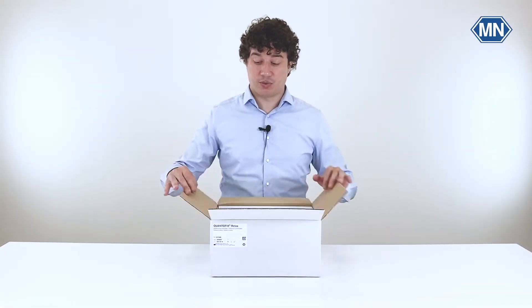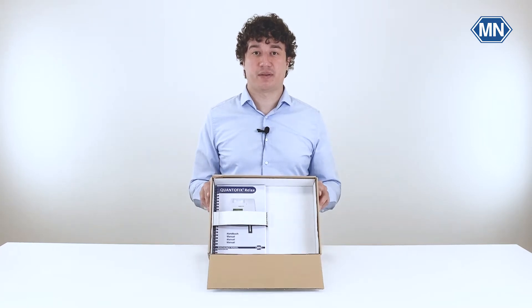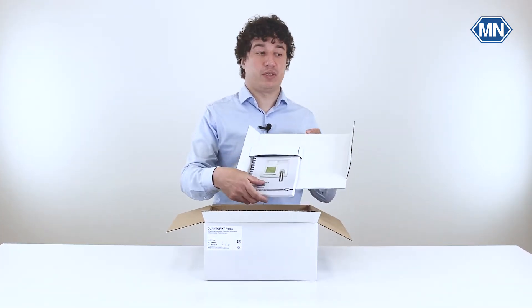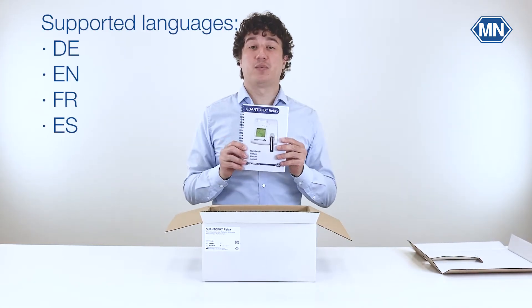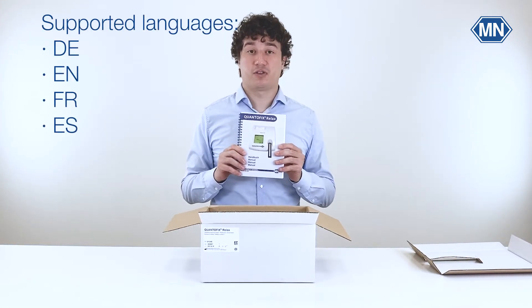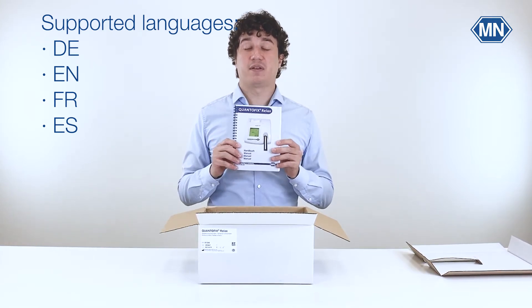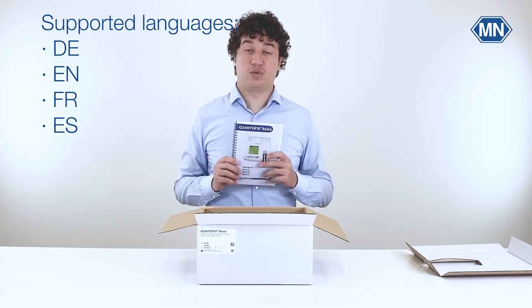Once you open this package you will notice that the device is protected by another layer of cardboard. Take out this piece which also holds the manual in place. The manual comes in four different languages and describes all the important functions of the photometer as well as the safety instructions, so you should definitely make yourself familiar with this before using the photometer.